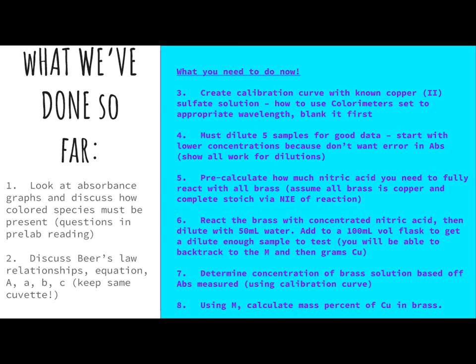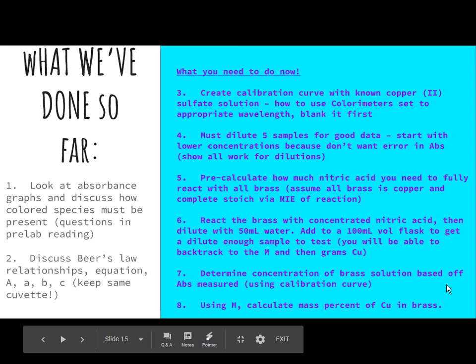You need to test 5 samples. So you're going to have 5 molarities, 5 absorbances. Data table. Maybe write that down for yourself. 5 concentrations, 5 absorbances. Before you start testing, what do you have to do with your colorimeter or Spec 20? Calibrate it, right? Meaning put a blank in, let it read the blank first.